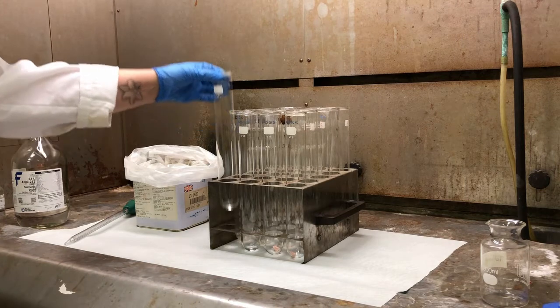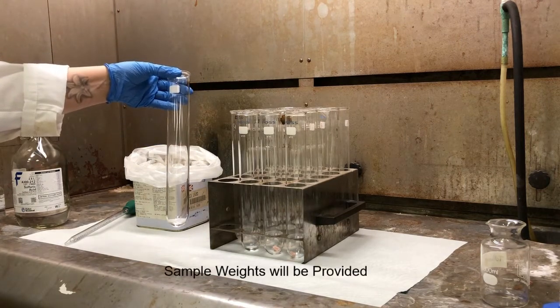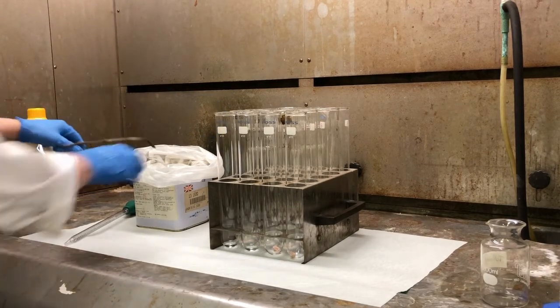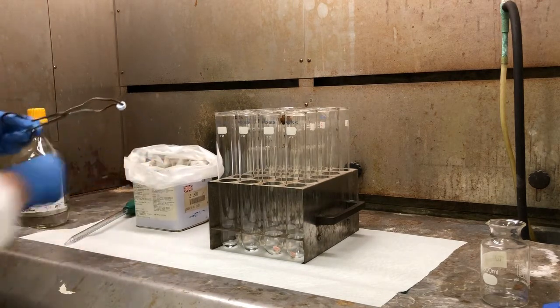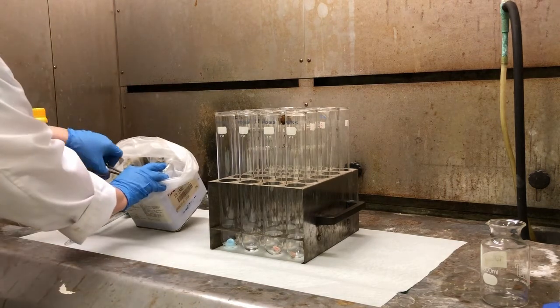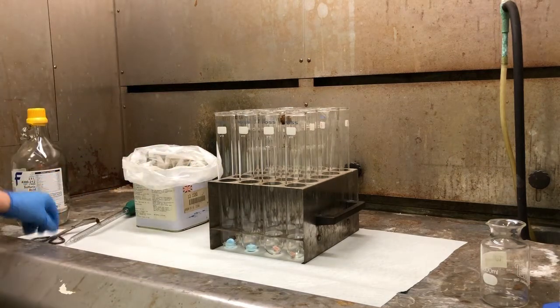So here's our sample in the digestion tube. We have a small amount of the water sample there in the bottom. And to that I'm going to add a catalyst tablet. These are just little blue tablets, almost looks like a tongue. We'll put that in our sample. Two samples ready to go. Put one in each one.